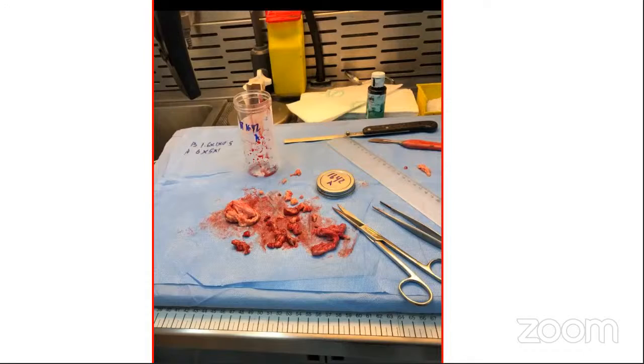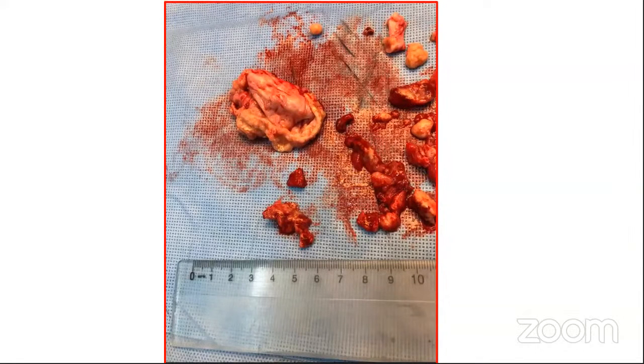So we received the cyst from the OR along with other fragments of tissue. We received the tissue fresh, with no formalin fixation. It's very important not to place tissue intended for frozen section in formalin, and to send it fresh directly to the histology lab. This is a closer picture. You can see the cyst is already opened by the surgeon, and we can see multiple tissue fragments, probably necrotic, and the cyst shows some fragments inside the cyst wall.